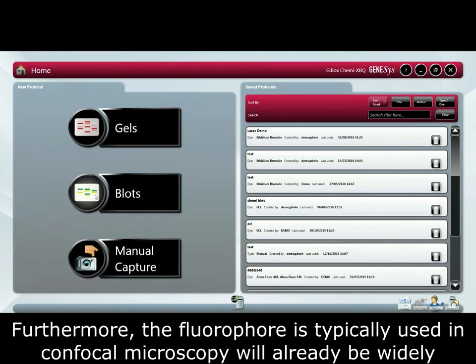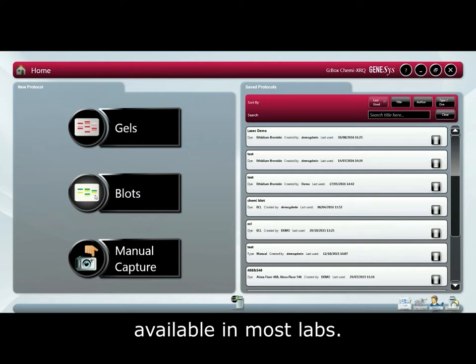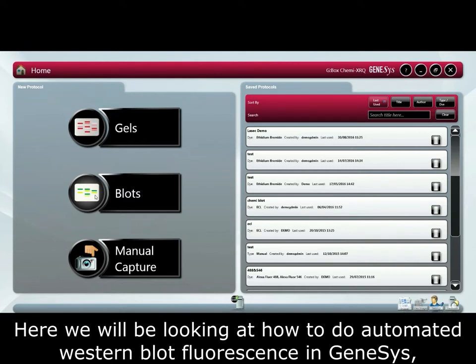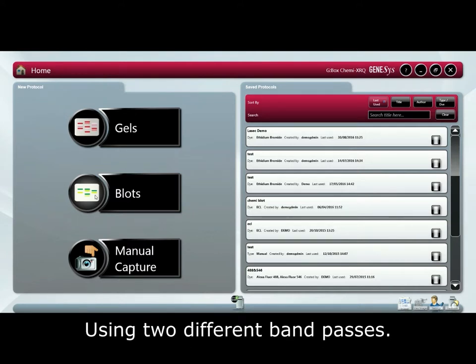Furthermore, the fluorophores typically used in confocal microscopy will already be widely available in most labs. Here, we will be looking at how to do automated western blot fluorescence in Genesis using two different band passes.